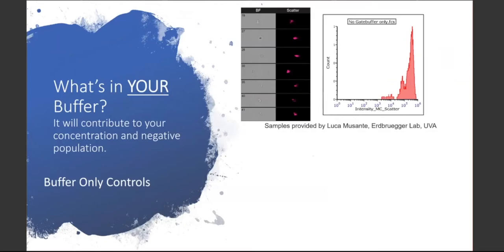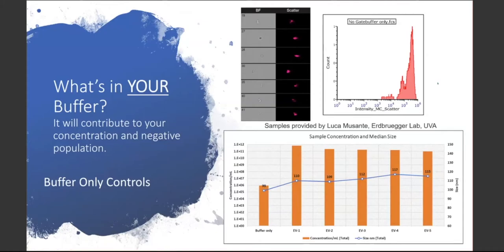The first thing we're going to talk about are buffer controls. What's in your buffer? Even after filtering buffers, you're still going to get some scattering of events that will end up in your data file. Generally, if they're very large, they'll have a very high scatter and these are easy to gate out — larger particles are not as much of a problem as the small ones. However, we recently did some sizing across several samples as well as the buffer, and you can see that the events showing up in the buffer are certainly within the size range of what we expect for a lot of our EVs.